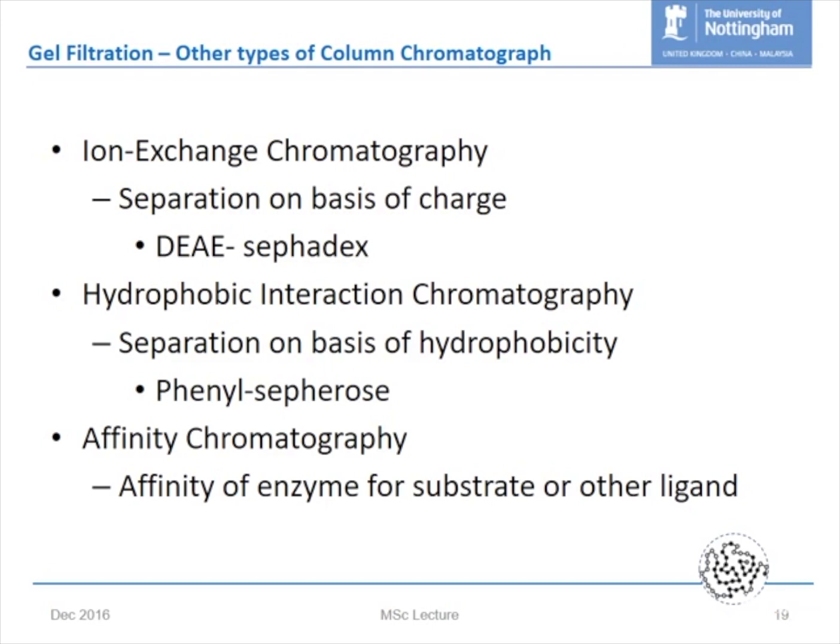Now, with all these types of chromatography, because we have a chemistry going on, we can change the solvent strength of our mobile phase. A great example of that is when we're working with HPLC, maybe reverse phase, where we'd typically have a binary gradient. That binary gradient means we've got two types of solvent in there. One is a strong solvent, one is a less strong solvent.